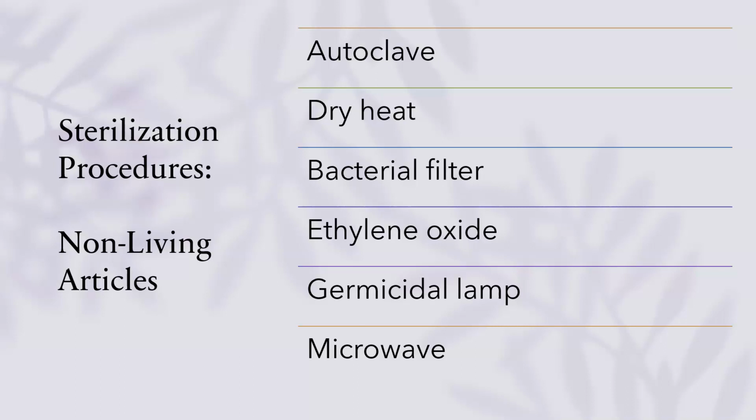An alternative method of sterilizing glass goods and instruments is by heating in an oven at 150 degrees Celsius for 3 to 4 hours. Thermolabile compounds are often sterilized either at room temperature or in cold by passing through a bacteria filter. Plastic containers such as petri dishes or plastic centrifuge tubes that cannot be heated are usually sold after sterilization with ethylene oxide gas, and they cannot be re-sterilized.